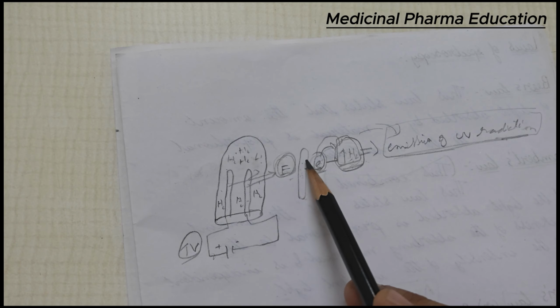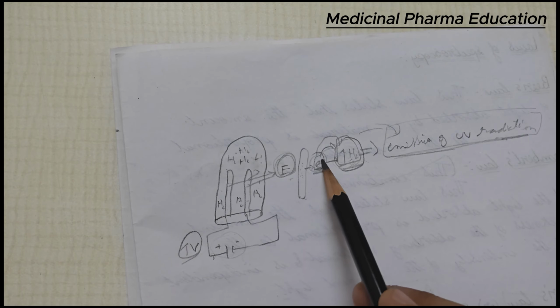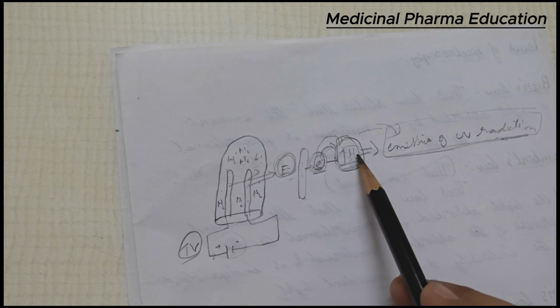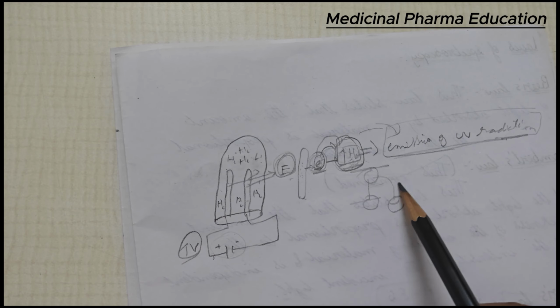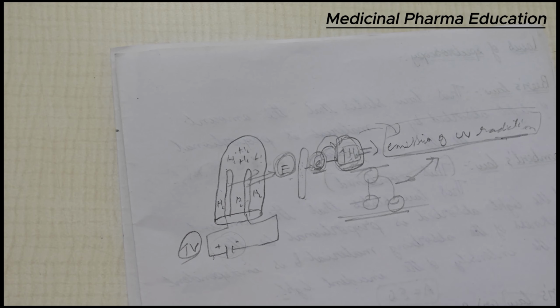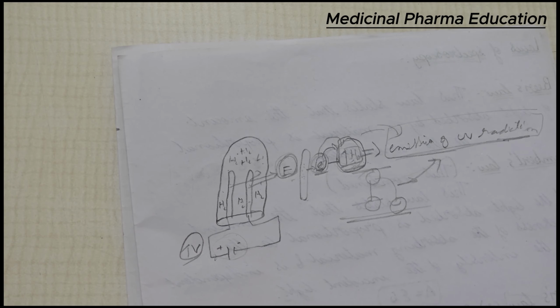Electrons from the electrode are released after the high voltage is applied. Then these electrons will excite the hydrogen atom. The excited hydrogen atom moves from ground state to excited state. As it is unstable in the excited state, it comes back to the ground state by the emission of UV radiation. This is the basic concept. I think you have understood the mechanism or the process.